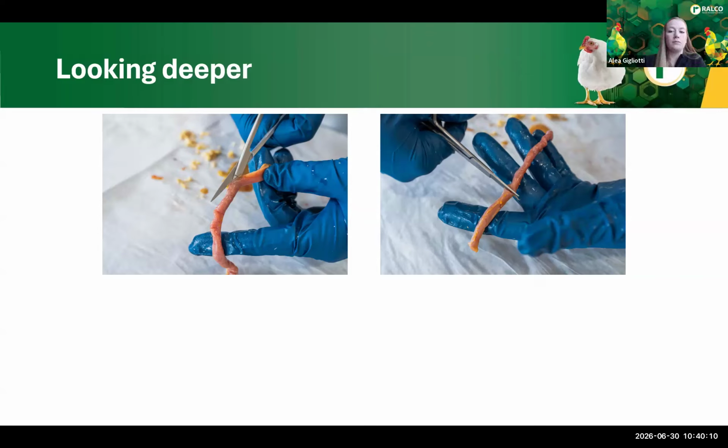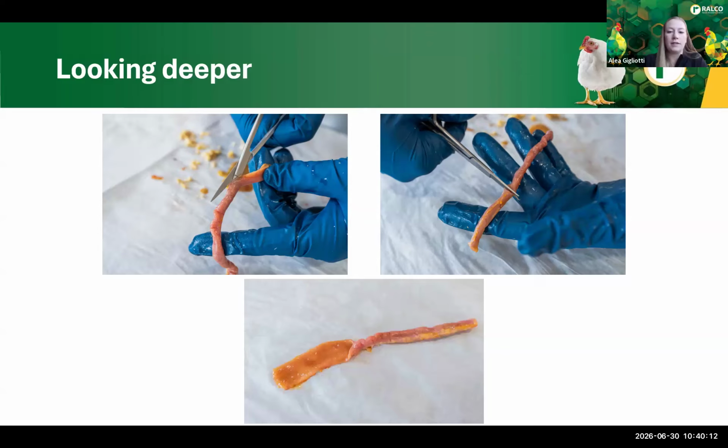And then, looking at the intestinal walls, looking at the membranes. Is there any kind of hemorrhaging? You can see bruising or maybe some lesions, some nodules, plaques, and things like that. But looking inside this intestinal wall and inside at this membrane can tell you some things that you wouldn't be able to see otherwise, including something like worms.